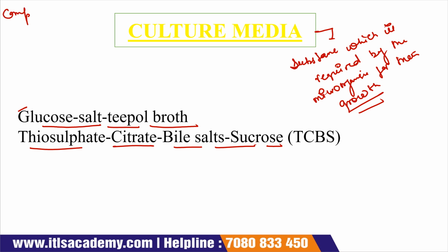This composition is for 1 liter of distilled water.